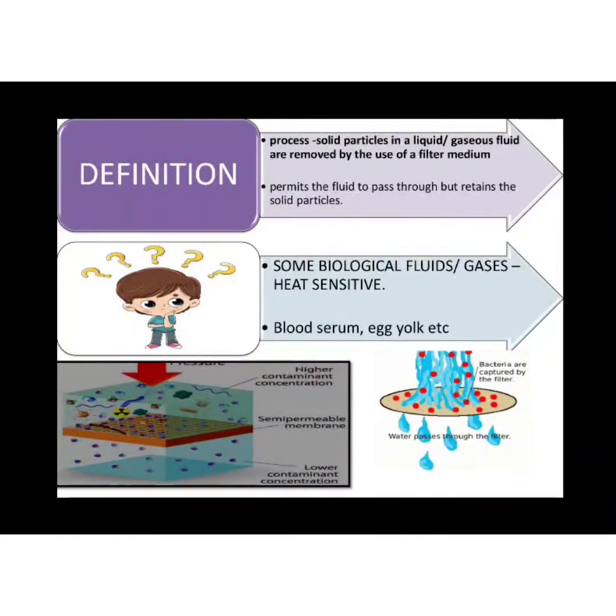Basically there will be a filter medium or a filter pad of a specific pore size and specific thickness. Now I want to filter something, some liquid or gaseous material, which is passed through this filter medium wherein the solid particles get separated out. So that is called filtration.